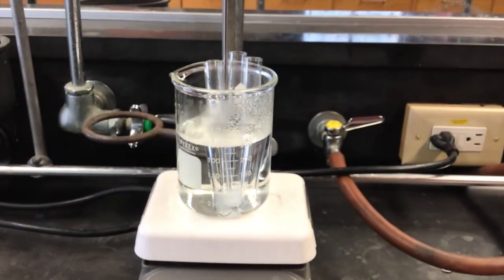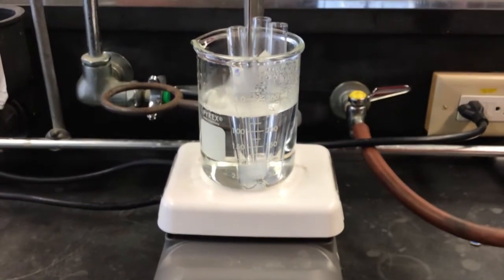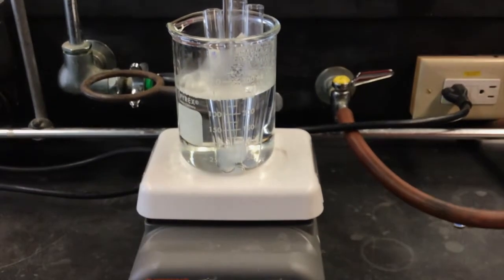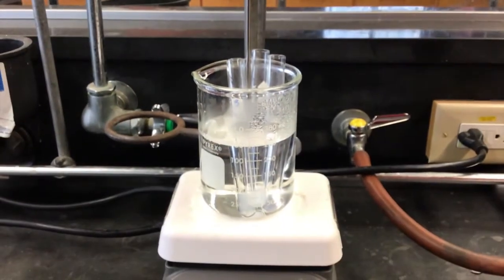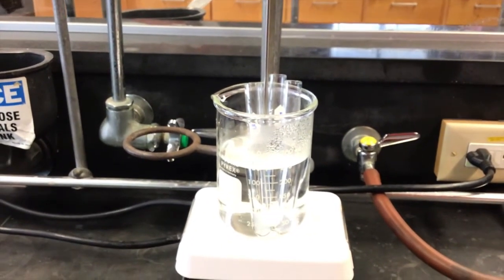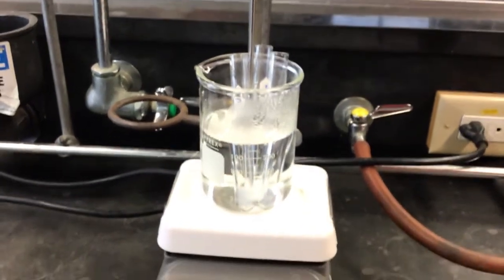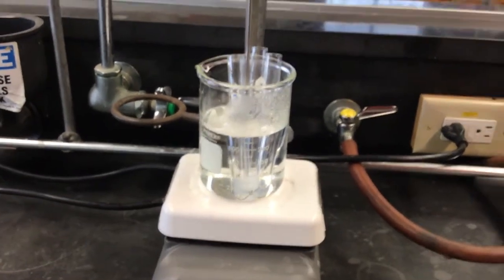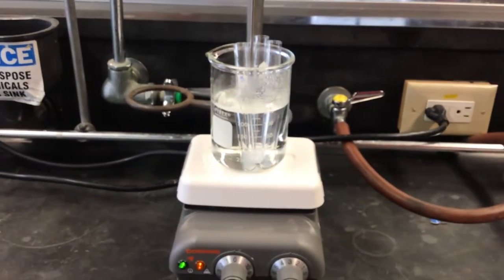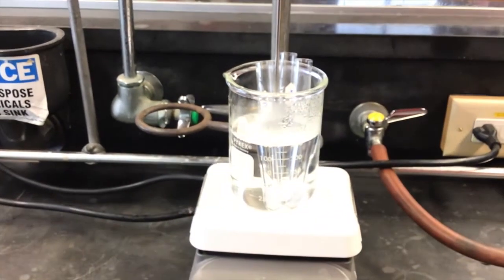Don't forget that this silver nitrate is added just to allow a precipitate to form so that it's obvious that the reaction did move forward. It's also going to help drive that reaction forward once that leaving group leaves, is gone because it precipitated out as silver chloride or silver bromide. And there you have it, folks. So I'm going to take these out and we're going to let them cool to room temperature. We'll take a little look-see, okay?